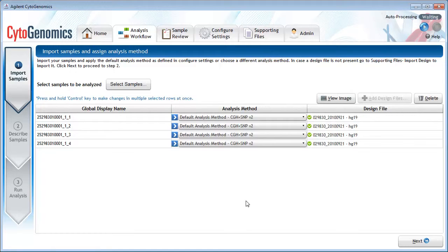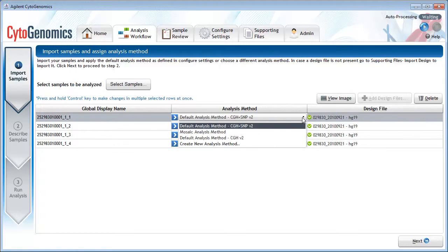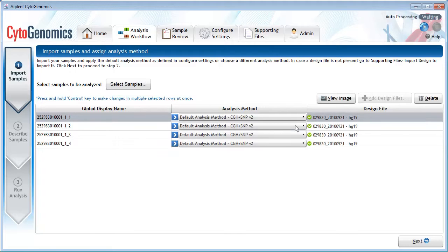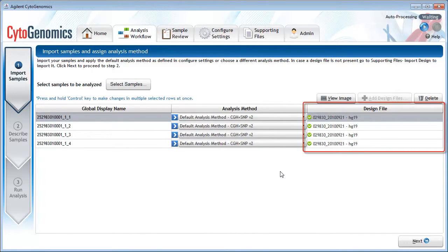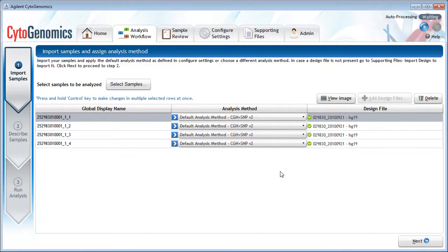If desired, you can change the mapping configurations from the Configure Settings screen. But you can also change the selection here using the drop-down. This third column lists the design file that the program will use with the sample. The selection is made automatically based on the array's barcode.